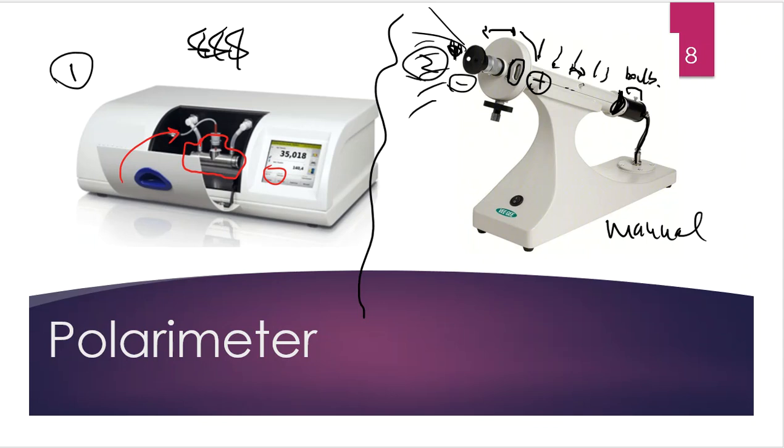This instrument knows where the 0 mark is at. This instrument will go ahead and turn that lens for you, and this instrument will report, ta-da, some numbers that we can just write down, and that's really all that we need from it. So it makes life much simpler. I don't really rely on someone's eyeballs to make the judgment call of how far to turn before they stop, because the way the light comes through with your eyes might be slightly different than the way the light comes through with someone else's eyes.